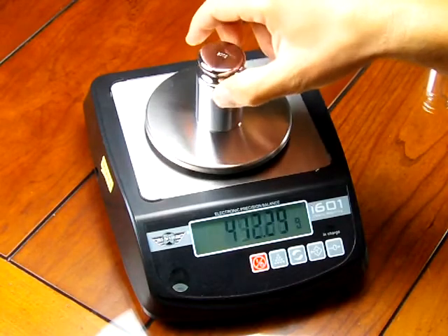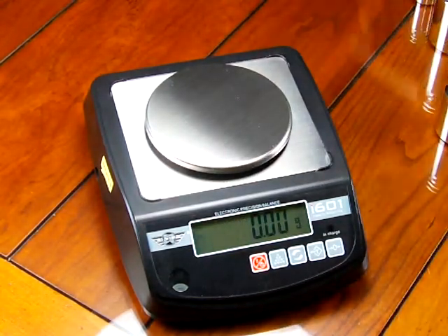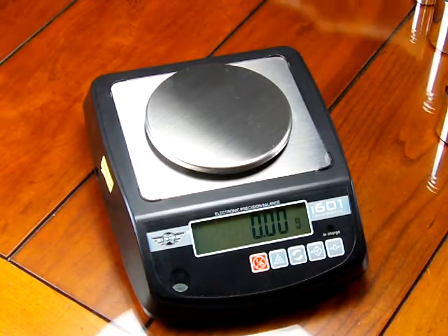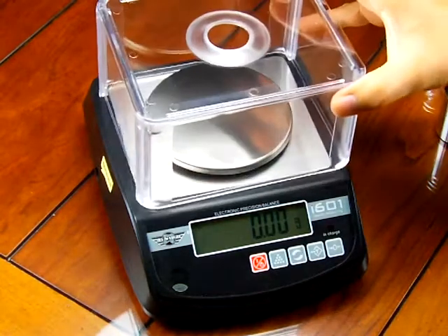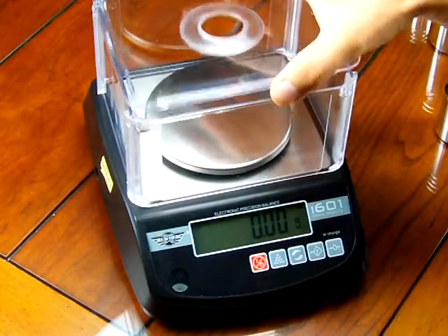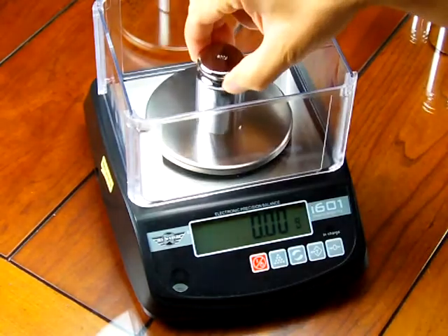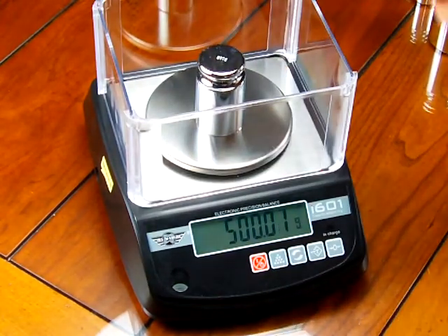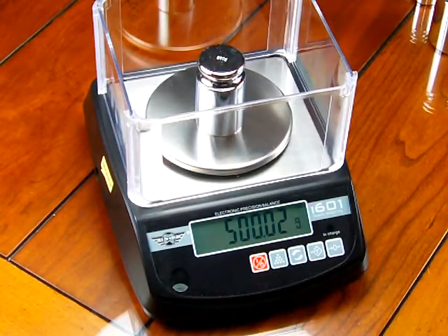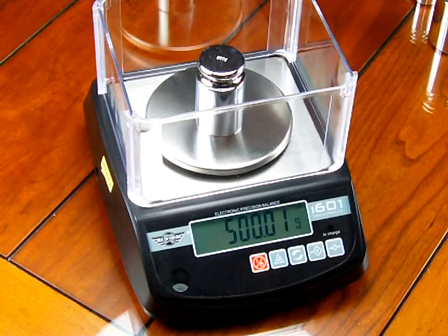has a stainless steel platform. And the scale does come with, I almost forgot, it comes with a windshield, which is pretty unique. So this windshield fits right on the balance, and one could put samples on the weighing platform from the top.